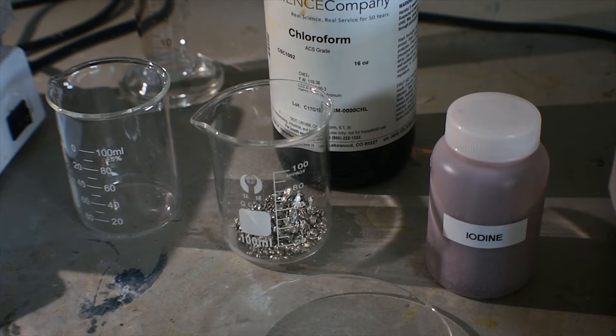Hello everyone, welcome back to another video. Today I'm going to be synthesizing stannic, or tin 4, iodide. Stannic iodide has the formula SnI4, where tin is in the plus 4 oxidation state.